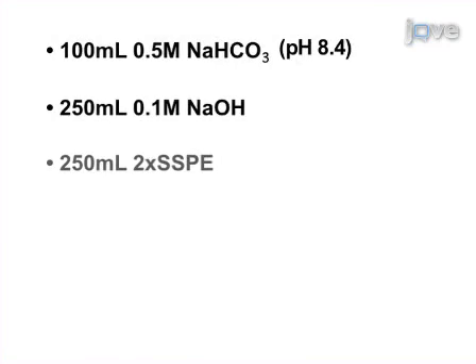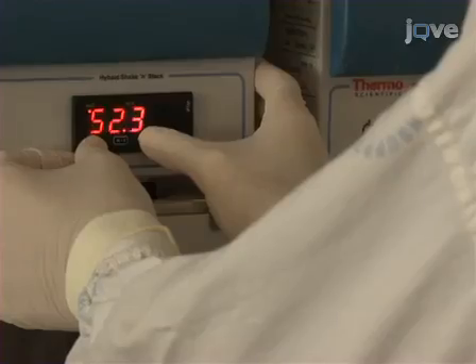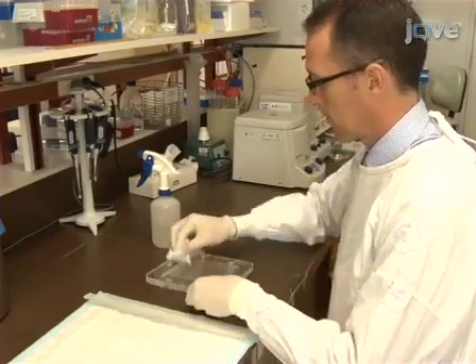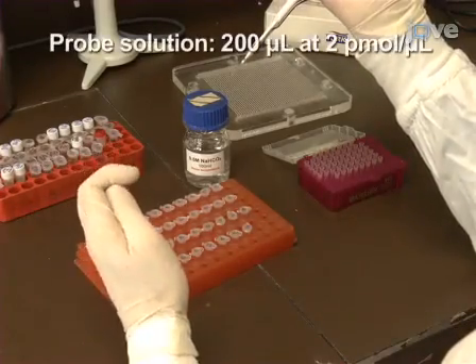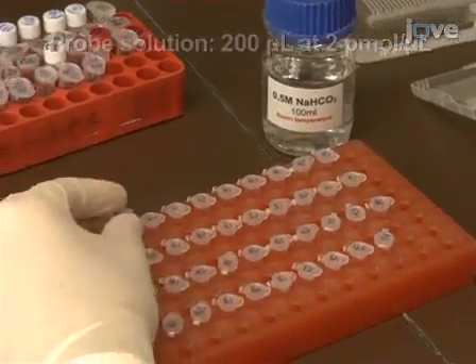Before beginning, prepare the following solutions according to the written portion of this protocol. To prepare the membrane, preheat the oven to 60 degrees Celsius. Clean the mini blotter with 70% ethanol. Dilute the oligonucleotide probes in 0.5 molar sodium bicarbonate to a final concentration of 2 picomoles per microlitre and a volume of 200 microlitres.